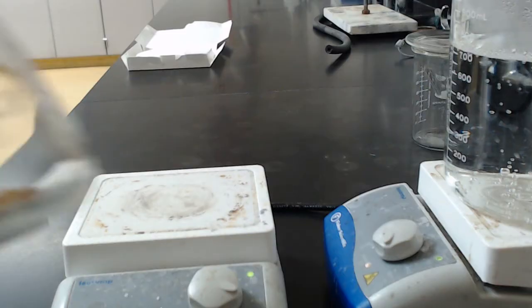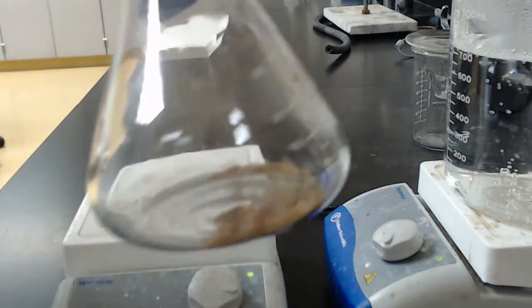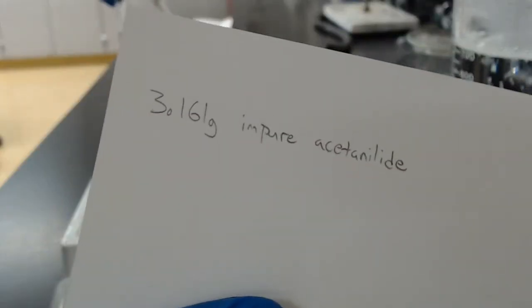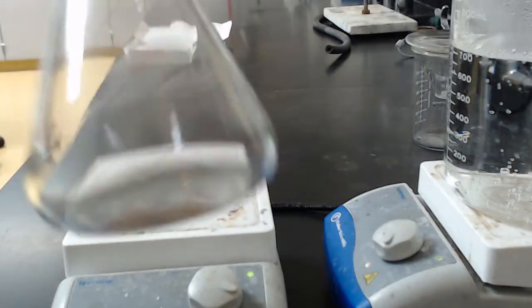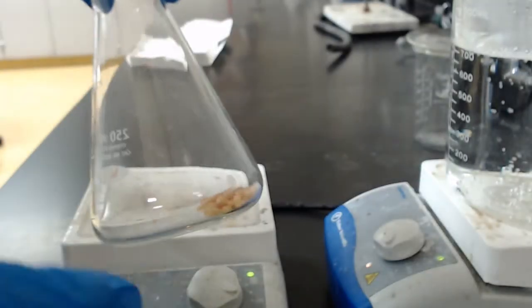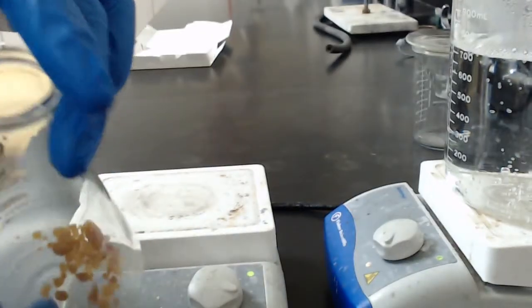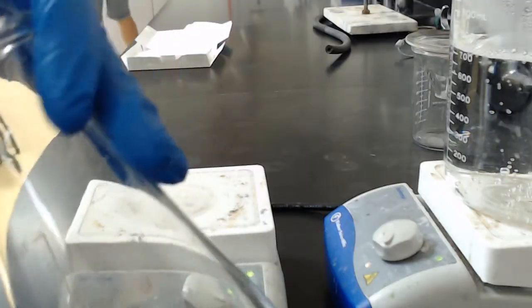All right, let's go ahead and take a look. All righty, today we're going to go ahead and start with some impure acetanilide. We have 3.161 grams of impure acetanilide. The impurities here are likely table salt, and there is some aniline in there as impurities today.